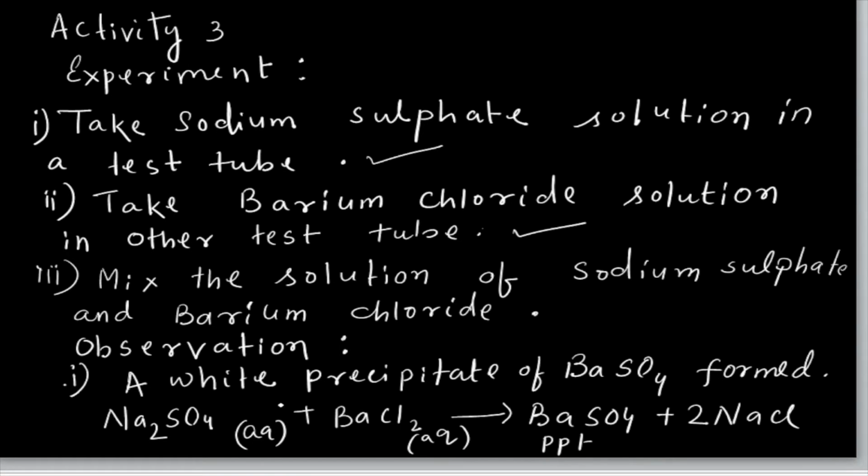They are very interested in this, because how, with a colorless solution, a colorless, clear liquid, when both are mixed, can you get a white color that looks like milk? So it is a very, very interesting experiment for others.